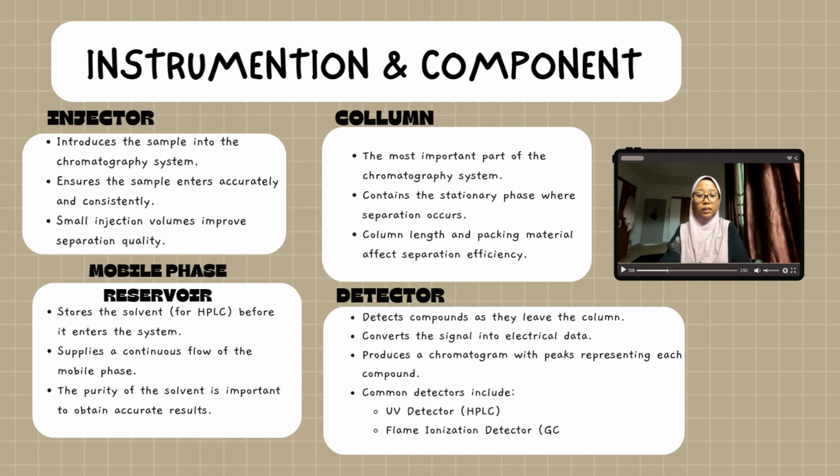Third is the mobile phase reservoir. It stores the solvent for HPLC before it enters the system and supplies a continuous flow of the mobile phase. The purity of the solvent is important to obtain accurate results.